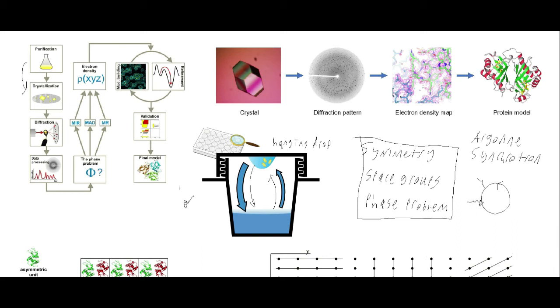I think the X-ray would probably actually be sort of tangent to it. You have areas around this where you actually collect the X-rays, and then you can use what's called synchrotron radiation to hit your crystal.